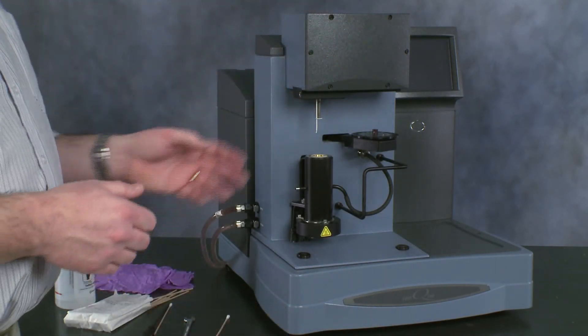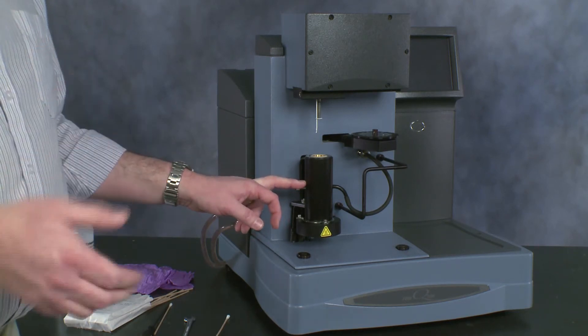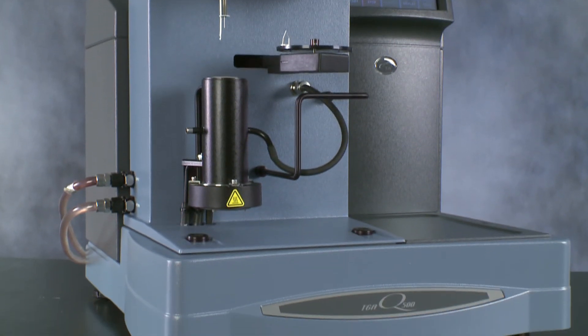We can then power the furnace back on and we're ready to go again. Before we start any testing, we want to take the furnace up to an elevated temperature and hold for a while just to drive off any residual solvent. Once we've done that, we're ready to run samples again.